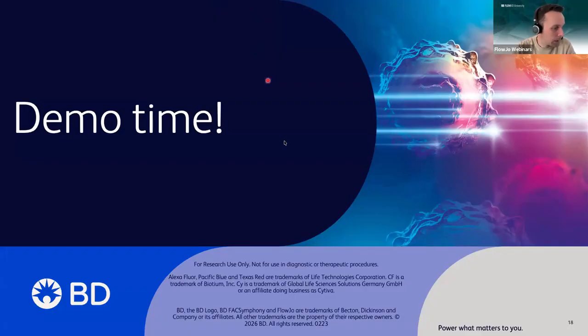I see a question in the chat before I jump there. Around when did algorithm-based QC approaches like this start to become widely used? I was actually working on flow cytometry in 2010. I don't remember, I graduated at the time. FlowClean was the first QC algorithm published, and if I remember correctly, it was in 2016.